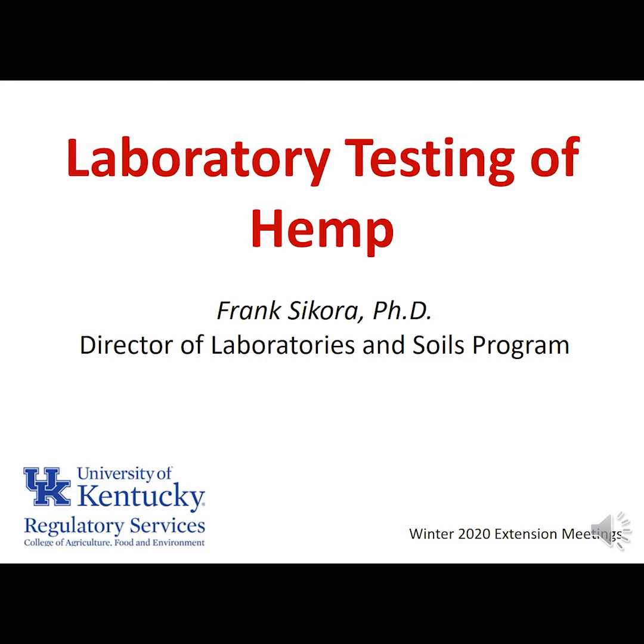Today I'll be talking about our laboratory testing of hemp, the work we're doing for Kentucky Department of Agriculture in testing hemp to determine if the THC concentration is in violation.